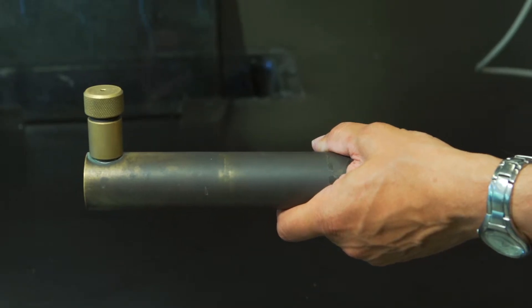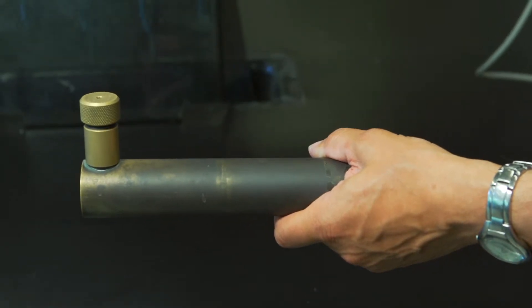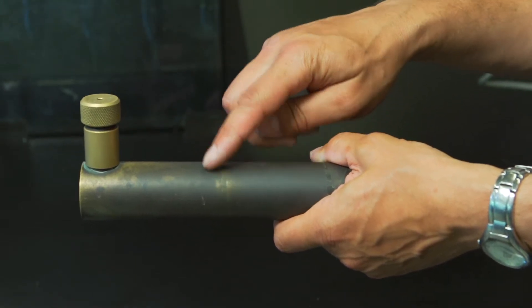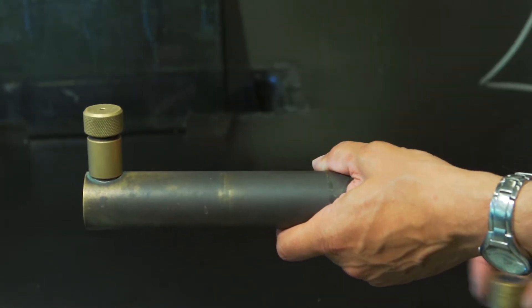Some of the photons produced by the reaction travel through this metal tube, which has a focusing lens in it here. This is what the focusing lens looks like.